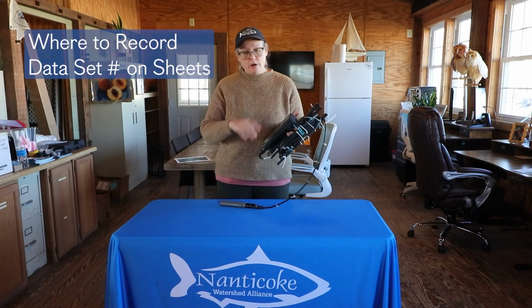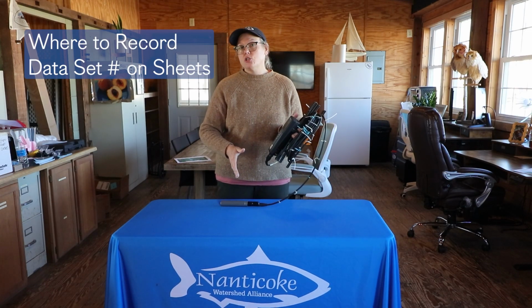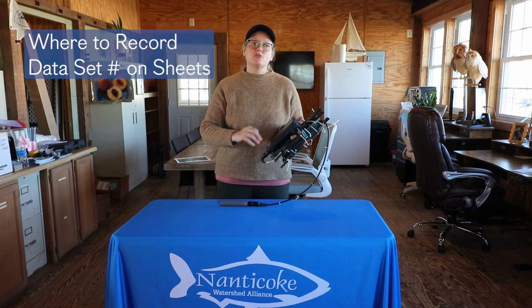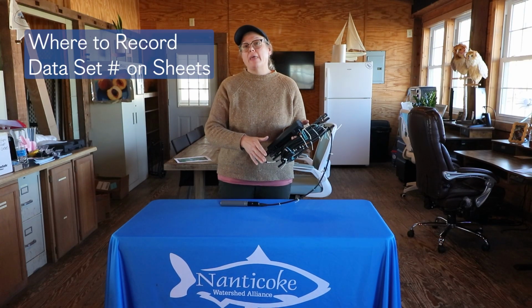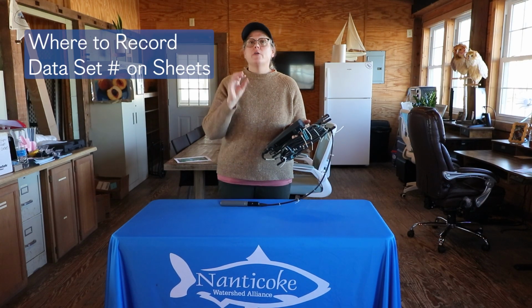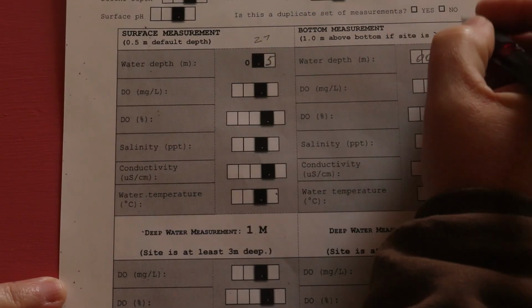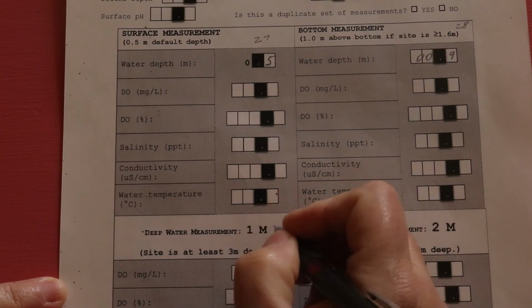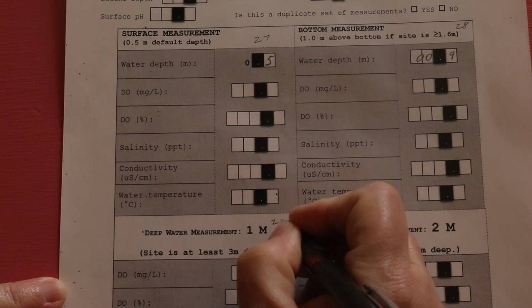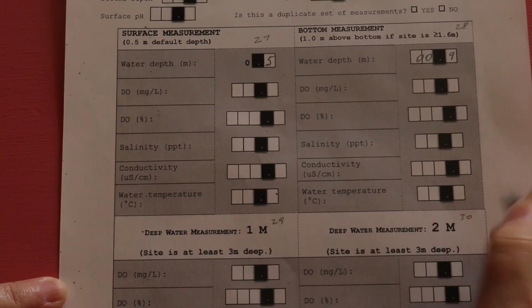People do record the data set that they have saved on their data sheets. If you want to do that, there's not a strict box to do that, but you can just put that on the water quality data sheet. You're going to put the data set number to the right of the surface bottom measurements. And also, if you're at a deep water site, then your meter increment measurements, you would just record the data sets to the right of those as well.